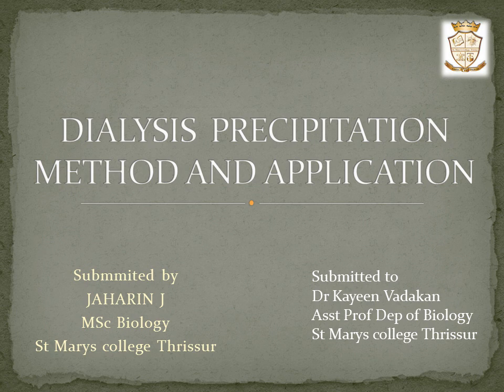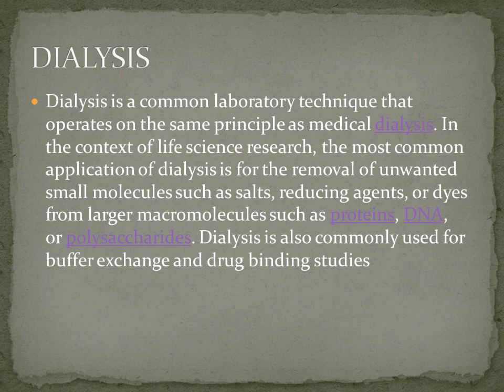Today we are going to discuss about dialysis precipitation method and application. Let's see in detail. Dialysis. Dialysis is a common laboratory technique that operates on the same principle as medical dialysis.